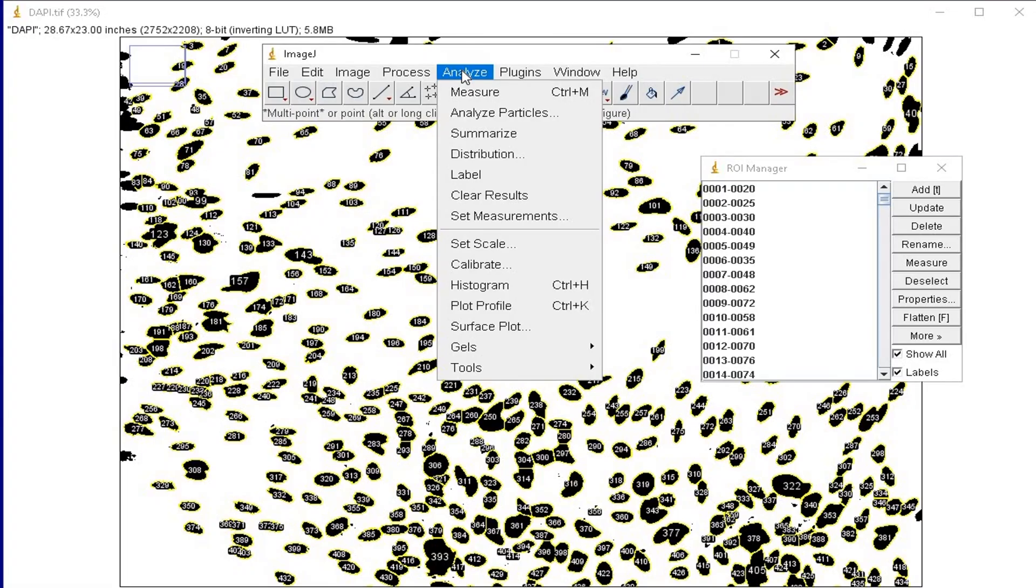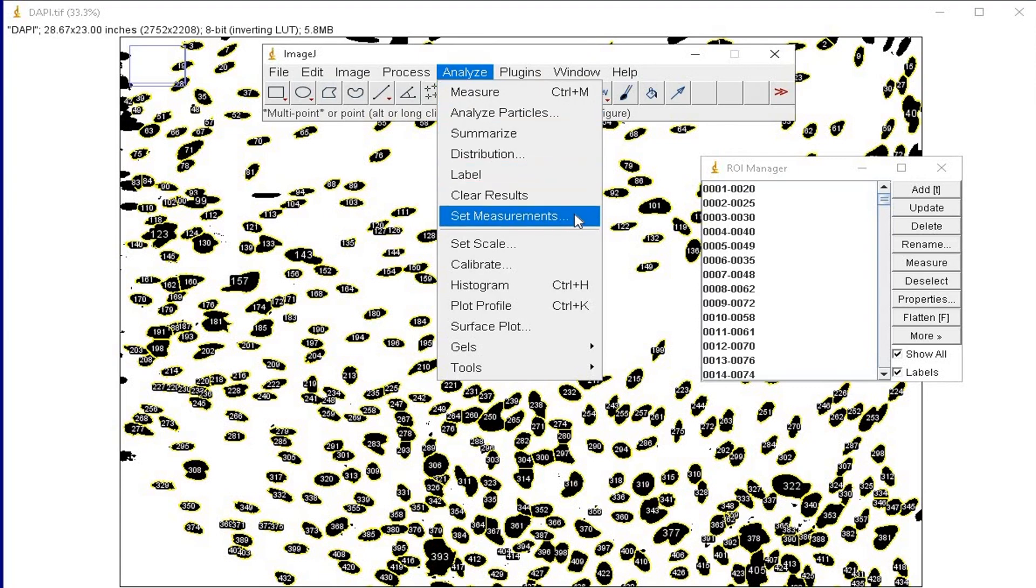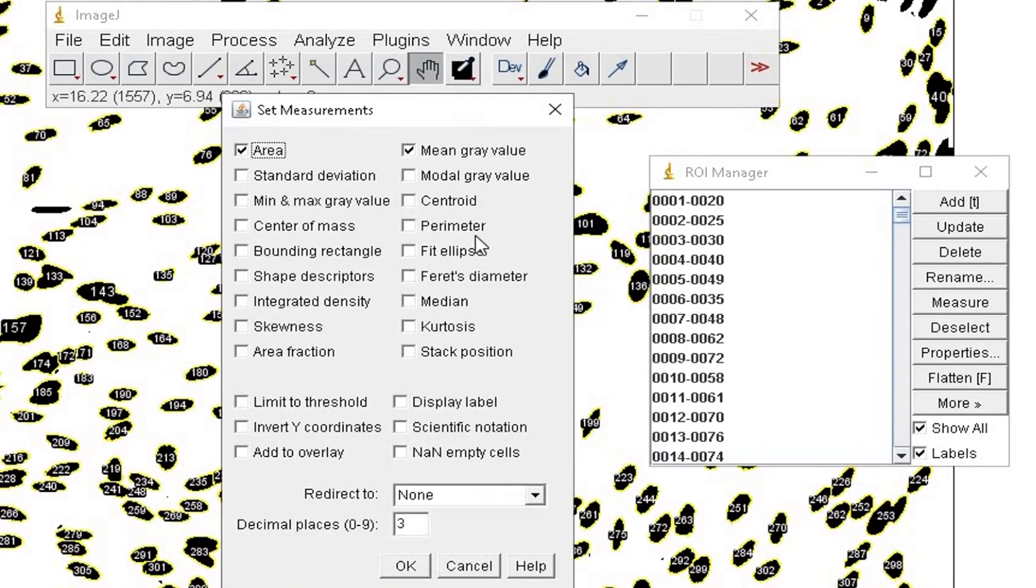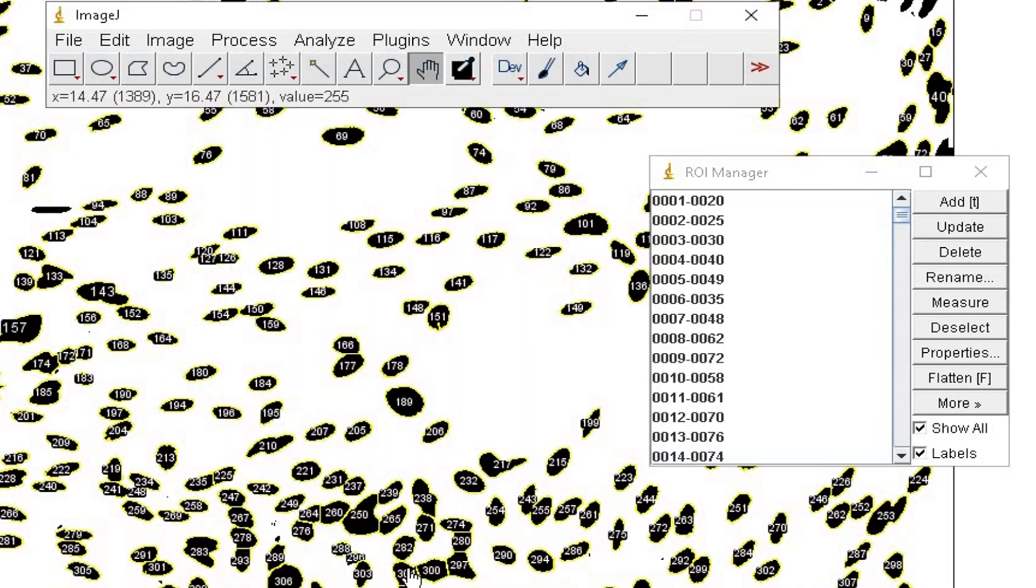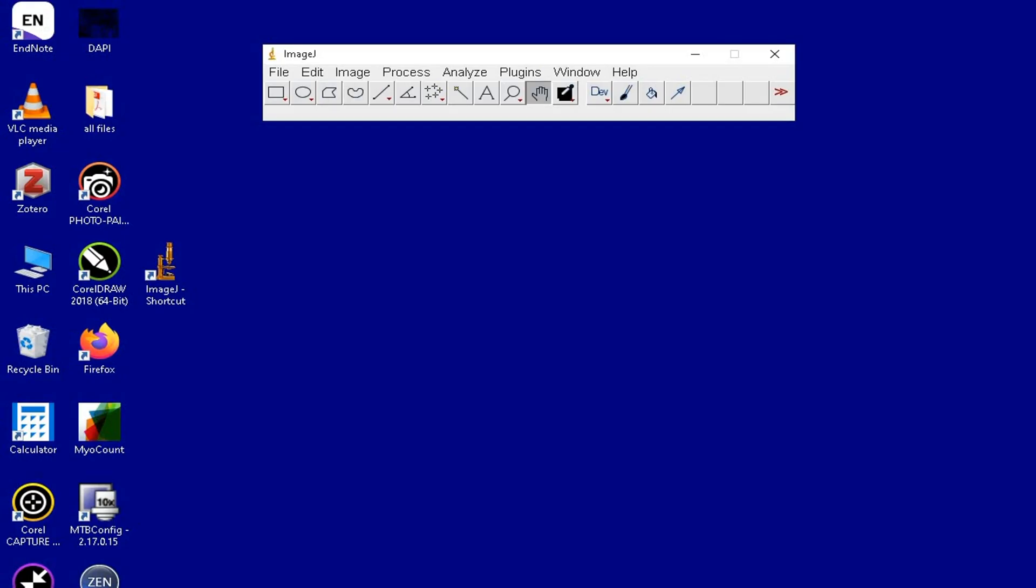Next, click on Analyze and Set Measurements. In order to measure the area and the intensity, check the area and the mean gray value option, and then click OK.